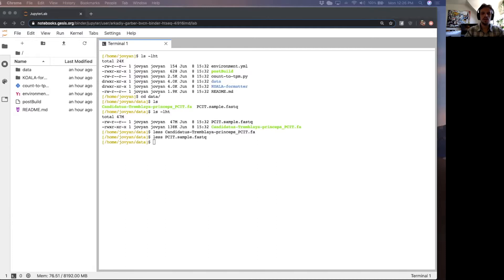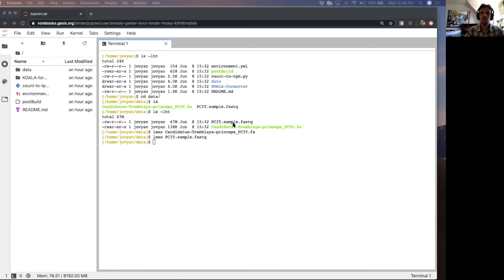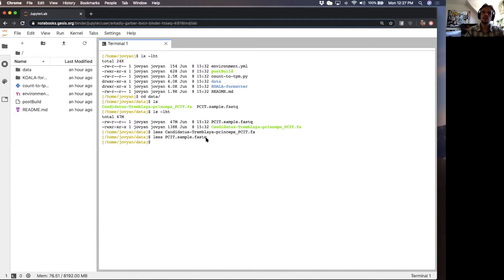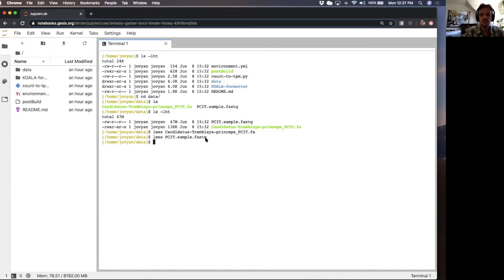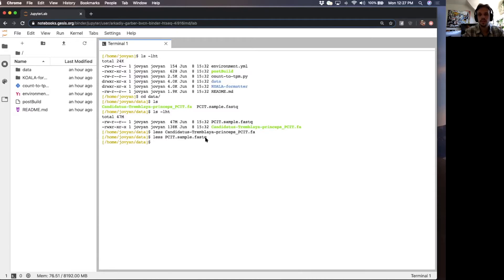A lot of this is going to be, I'm not going to talk too much about the read mapping or the generation of a GFF file, which is necessary for HTCount. But there is a mapping tutorial already out there. If you'd like to learn more about read mapping, then I recommend listening to Ella Zieratsky's lesson four for the metagenomics portion of BVCN.